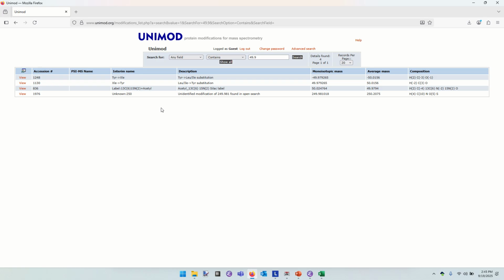What can we do with that? Well, it is possible to look through all the PSMs and ask on which peptides did I see this mass shift of plus 50, and how many were for phenylalanine. We're seeing a digest of that, but you could look through the specific instances of it. We could then ask, honestly, this is the thing we would need to know: do we have reason to believe that multiple mass shifts exist on this peptide that together add up to 50?